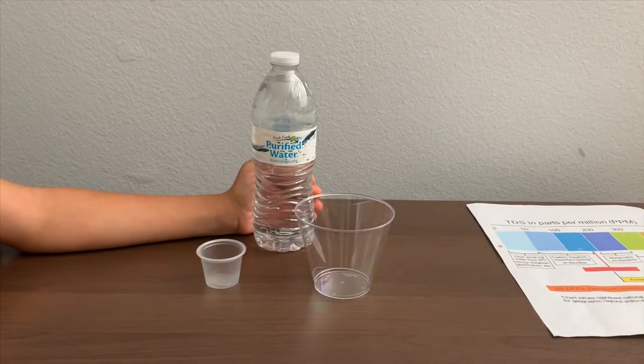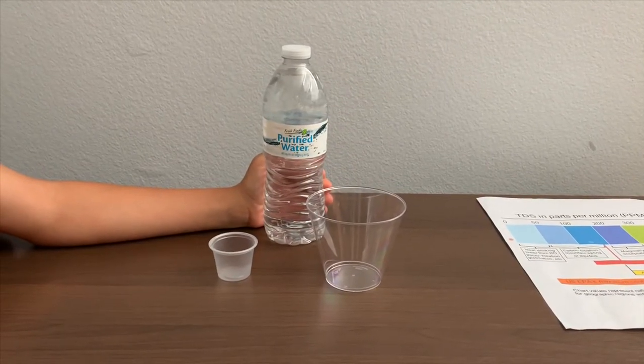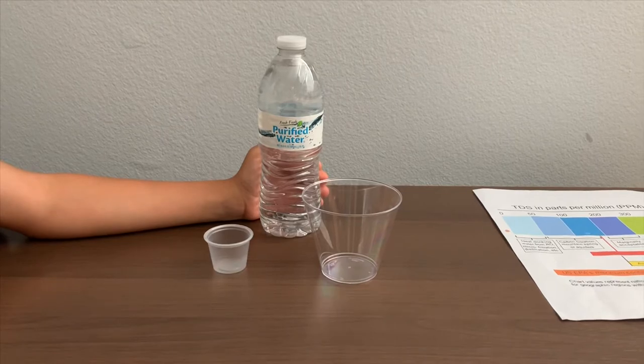This is Fresh Finds Purified Water. We bought it from Big Lots. Let's test the pH and TDS levels.